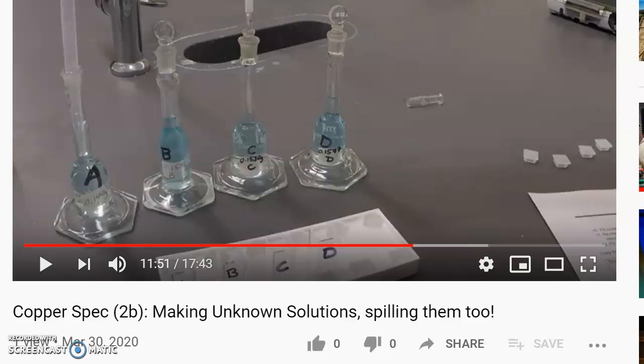So it knows how much light was shining through the sample, and then the sample absorbs a certain amount, and it also can read and detect how much light came through the sample. And the difference between those two is how much was absorbed. And the amount of absorbance is directly related to the concentration of that ion, the copper ion in solution. So let's see.